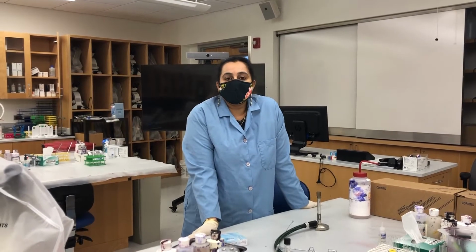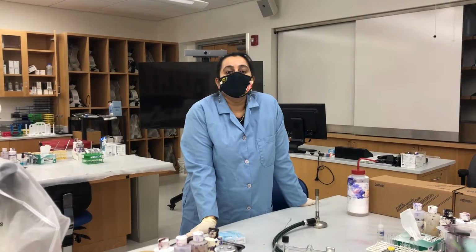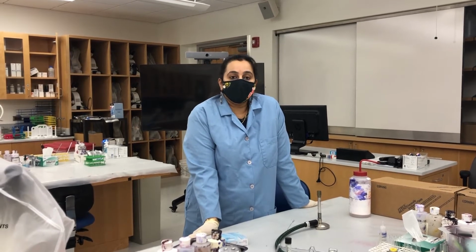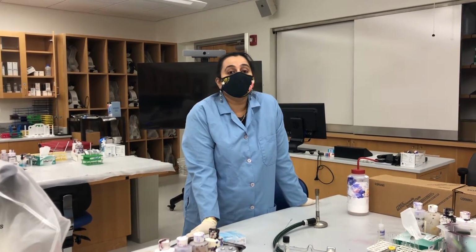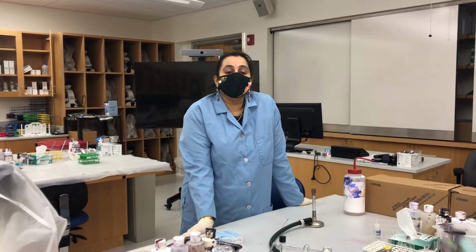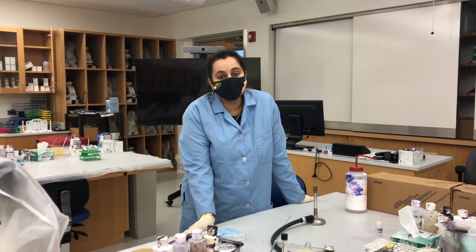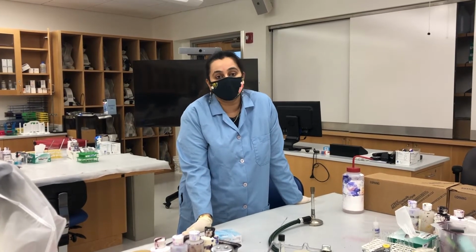As I already explained in your chapter 3, I believe, differential staining technique uses two different kinds of stains. So you have one stain that is known as a primary stain that is used and added to all the cells. You wash it off, you then go with another stain, you use the decolorizer to wash the stain off, and then you go with the second stain to differentiate the gram positive cells from the gram negative cells.